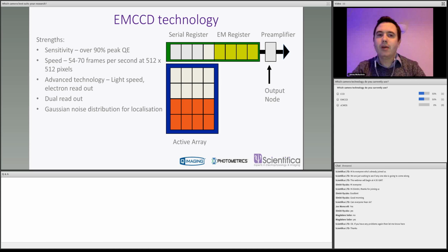On these cameras, you can use just small areas of the sensor and get up to thousands of frames a second. And one of the points you often have to remember is that if you want to go 1,000 frames a second, you need to be collecting enough light from your sample in 1,000th of a second to get you to that speed. So that's why the extremely high sensitivity and boosting above the noise becomes important.